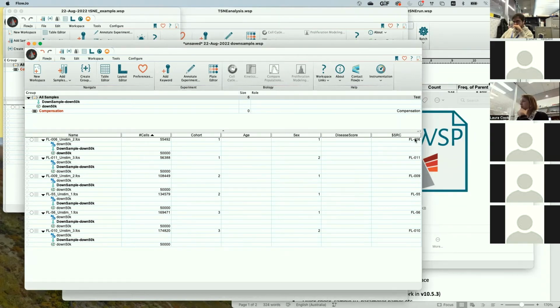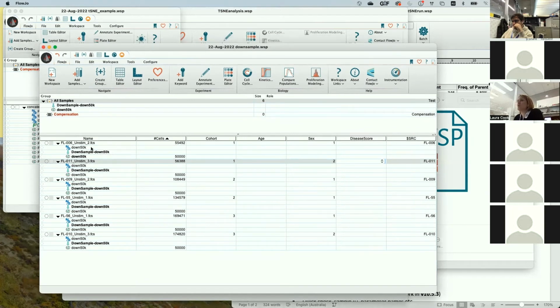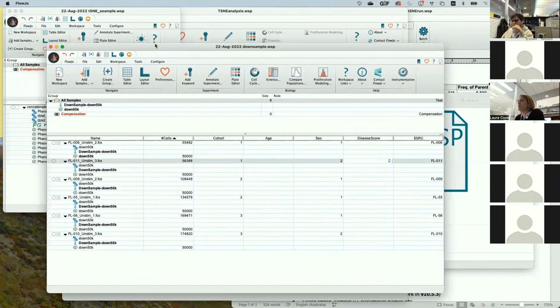So if you accidentally forgot to name it or you misnamed it when you exported your data, you can fix it here and say, oh, actually, this was patient 3, not patient 2. So you can do all that there when you're concatenating at the very beginning. And once you export it, the keyword will be corrected. So once you concatenate these files, all these data will be linked into it, and then coming back here, you can fiddle around with it.